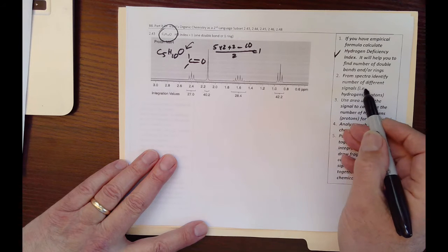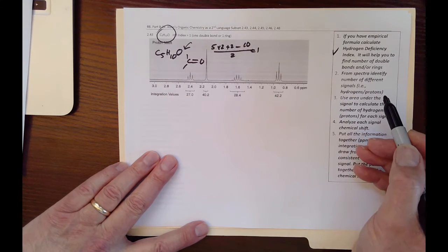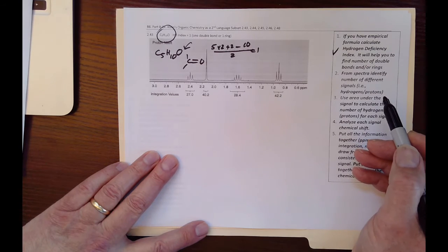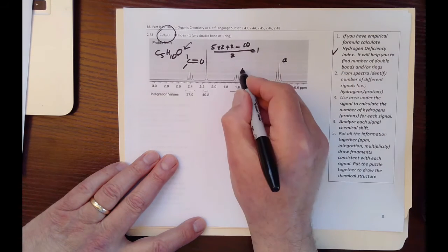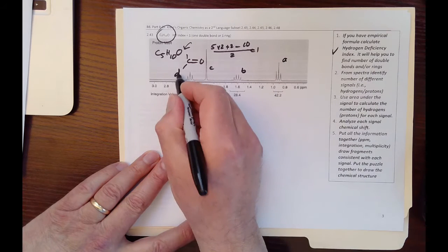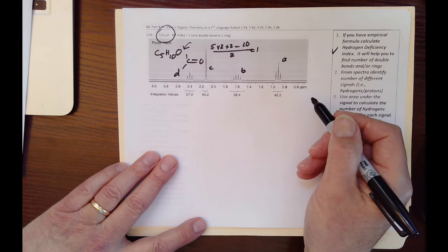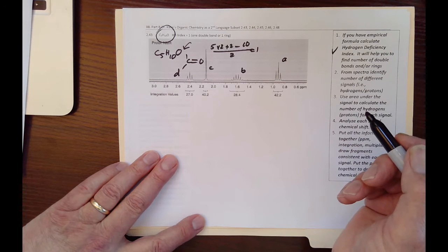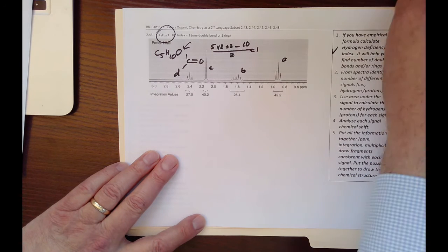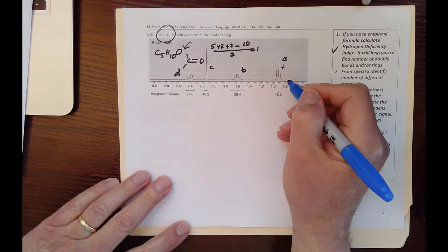Then identify the number of different signals in the spectra. Remember, if the hydrogens or protons are different, we have different signals. So also let's put letters there. We like the letters, so we can put A, B, C, and D. Typically we go from right to left, if I remember correctly. So what is A now? A, as you can see, is a triplet. We'll show it by T.